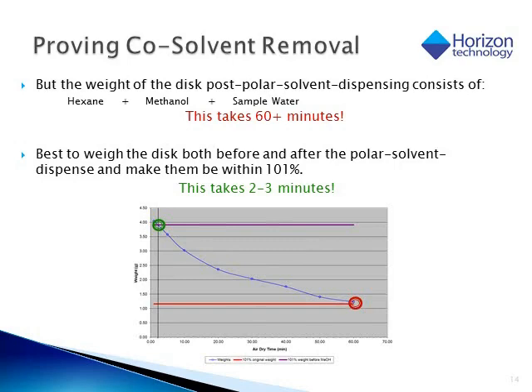You might hear some vendors say that they don't use methanol at all. I challenge those people to run a wastewater sample side by side with LLE and to publish the results. If that disc has a lot of stuff on it, then recoveries will certainly be poor.